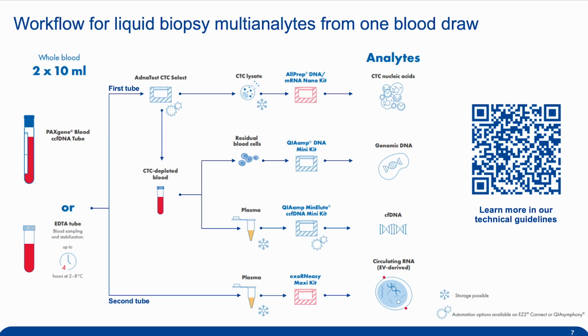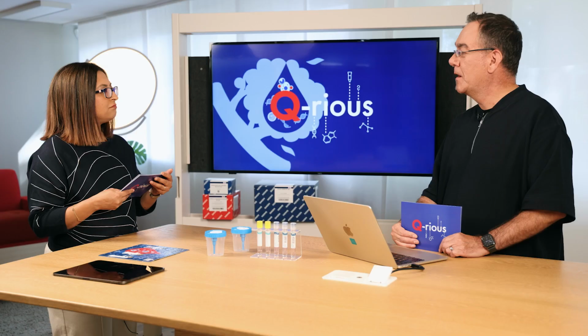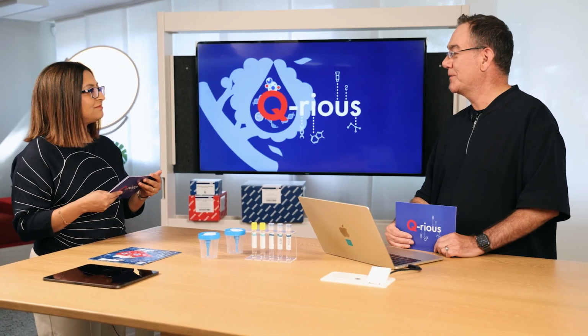So the DNA RNA isolation can be parked. For both the cfDNA isolation and the exosomal RNA isolation, you can freeze the plasma and then collect samples in the freezer until you have a sufficient batch size, and then do them all at once.